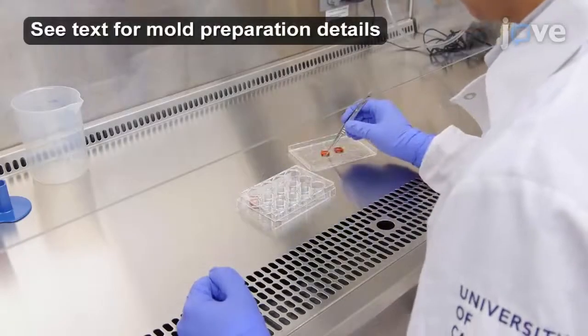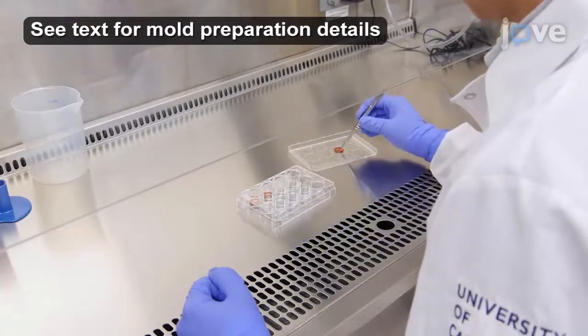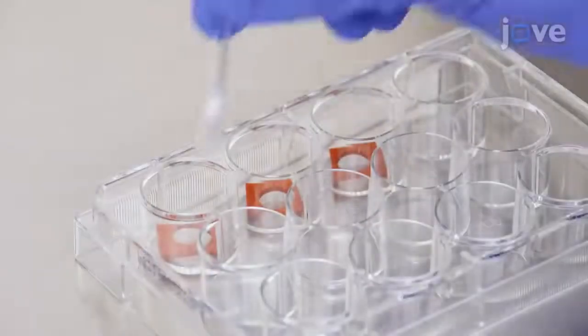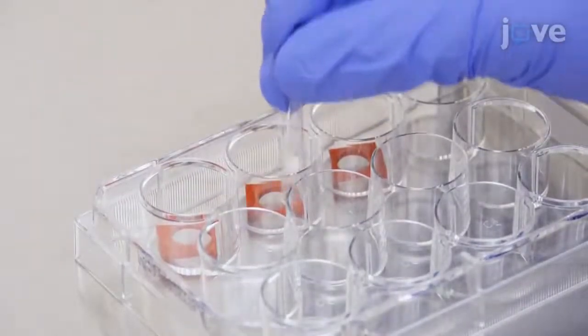To begin, place clean dry silicone rubber molds into each well of a non-tissue culture-treated 12-well plate and use the clean blunt end of a pipette tip to adhere the molds to the bottom of the plate.